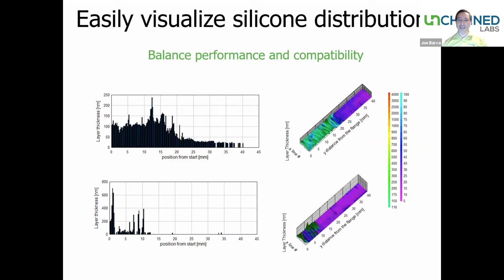As you rotate it, you get a three-dimensional view of that, which is going to show you the overall distribution within the syringe.